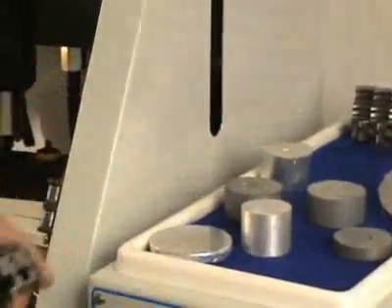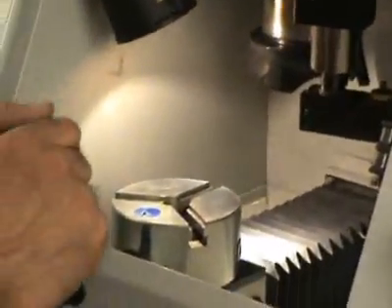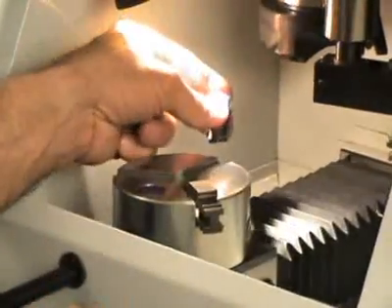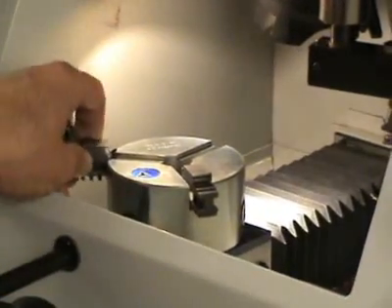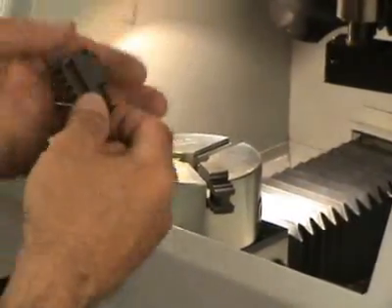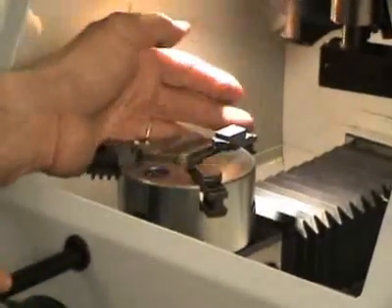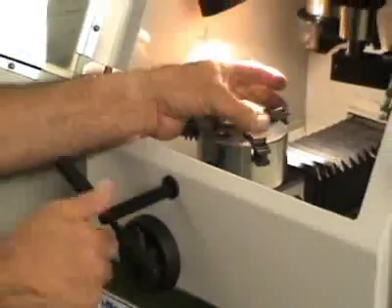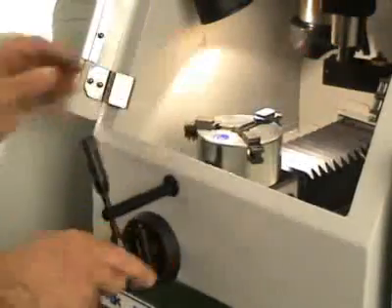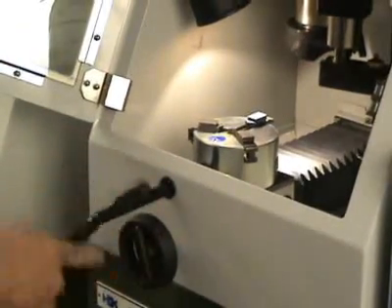For such thin samples, special brackets for low samples are supplied. In noble metal industry, samples are very thin, often in the size of a coin, and have to be fixed in such special brackets.